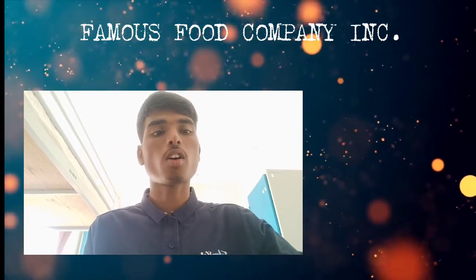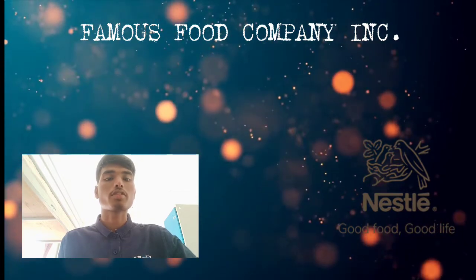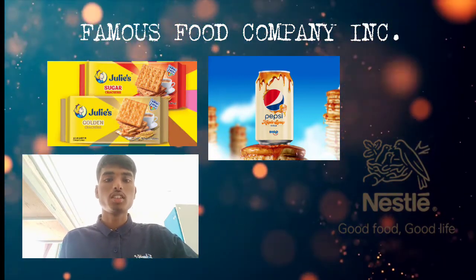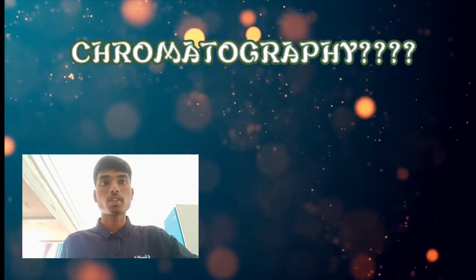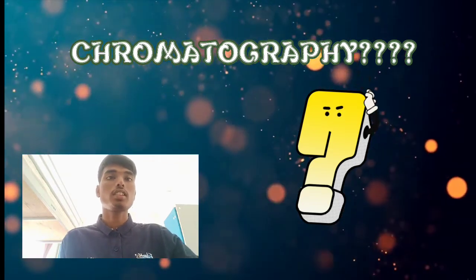Do you guys know what the food industry is? The term food industry covers a series of industrial activities directed at the production, distribution, processing, preservation and packaging of foodstuff or food products. So in the food industry, we use some chromatography technique to make sure the food is safe and healthy to consume.